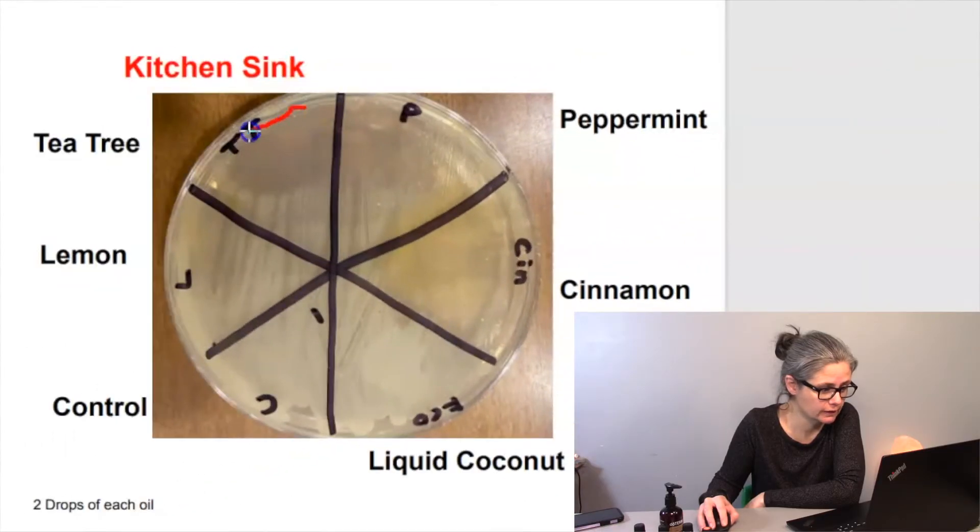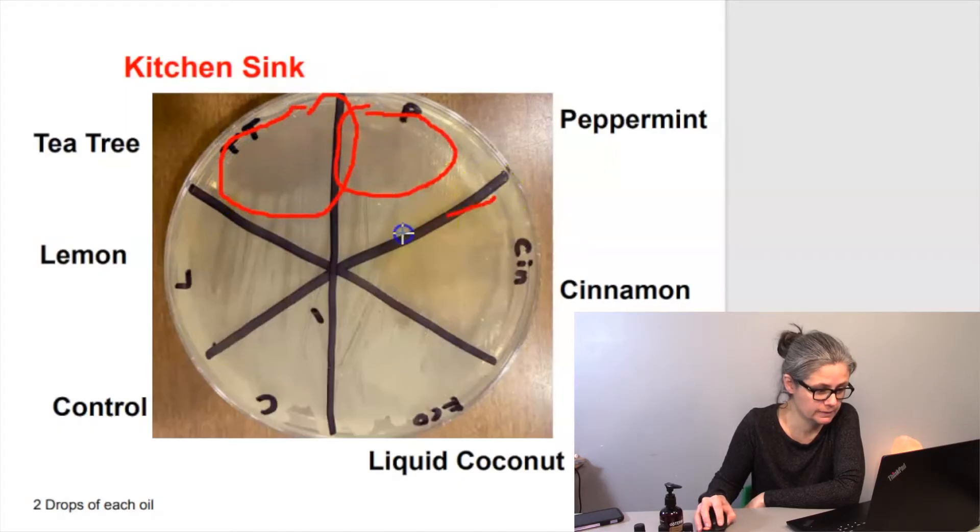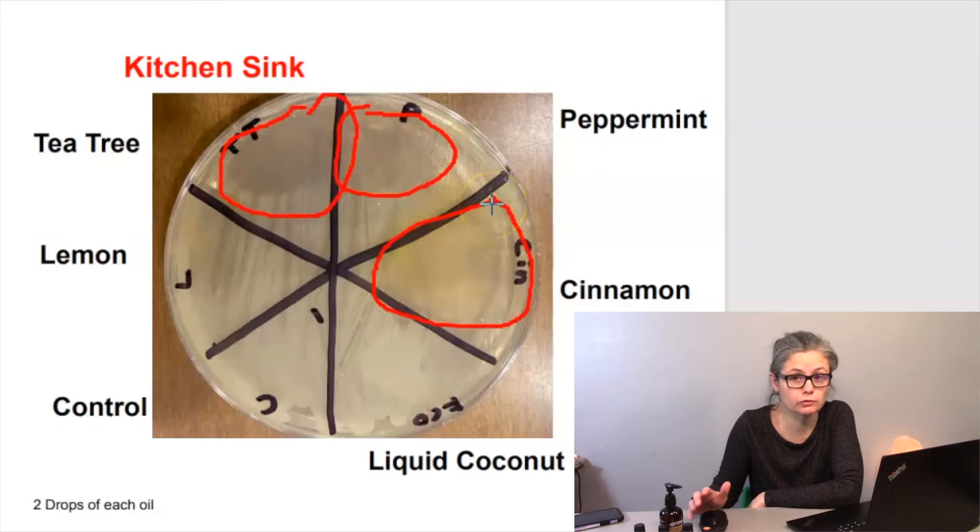Okay, now let's look at some results. So you can see here, the tea tree oil, the peppermint, and the cinnamon all have no growth in part of their section where I drop the essential oil.